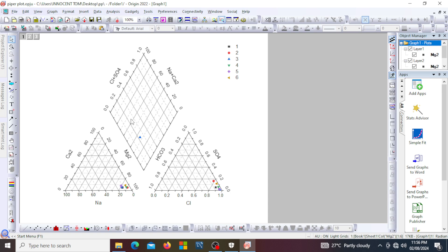When it falls towards the top, you have your water to be alkaline; towards the bottom, it is acidic. In our situation, it falls towards the bottom, so we have our water to be acidic. When it is in the middle, you have a balanced composition. If it falls towards the left, it is more dominated by cations; towards the right, it is more dominated by anions.